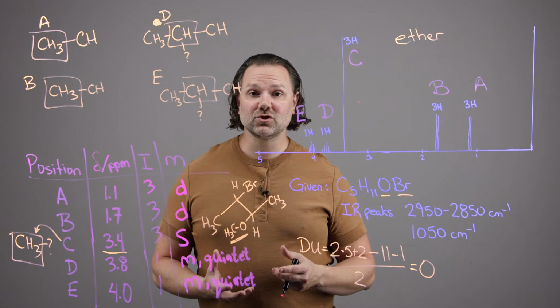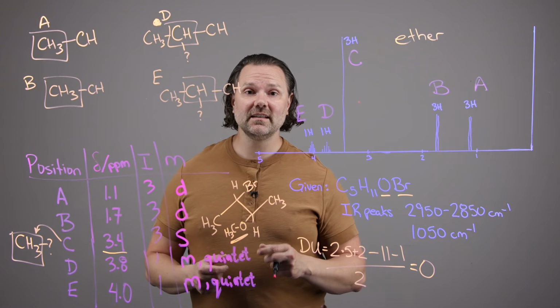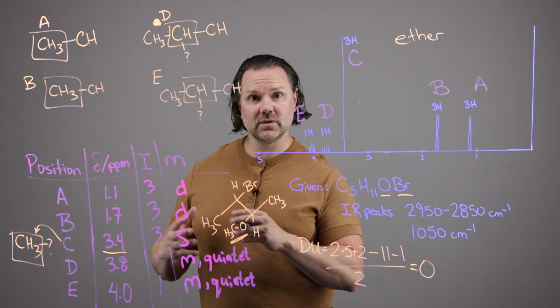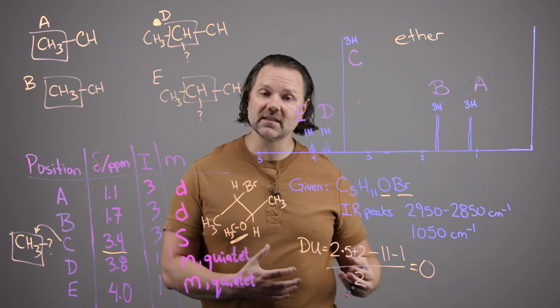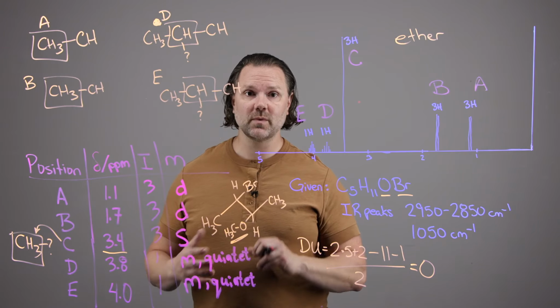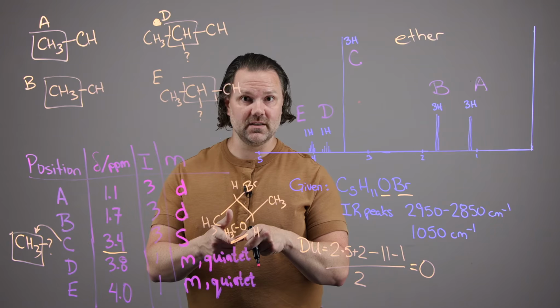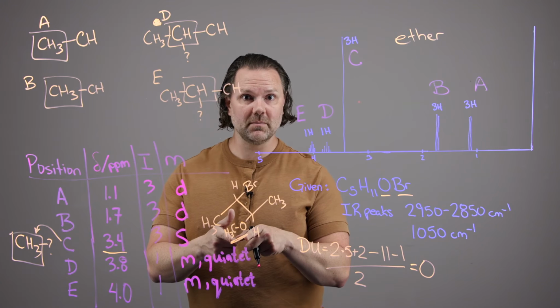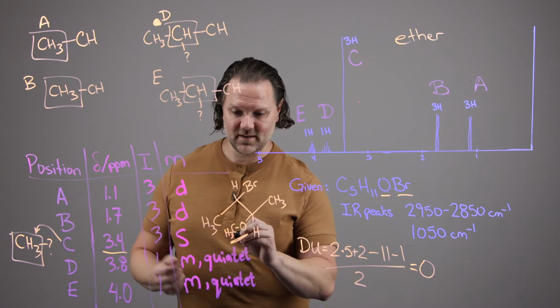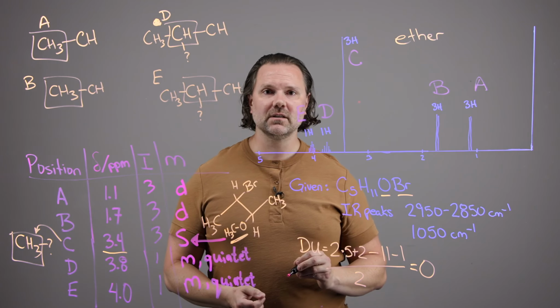All right, you've looked at your spectroscopy reference table and you see that a CH3 next to an oxygen should be somewhere between 3.3 and 3.6, with that lower end of the range representing the CH3 rather than a CH2 or a CH. So we expect this CH3 to be around 3.3 ppm. It's showing up at 3.4, and so that matches our signal right here, signal C.